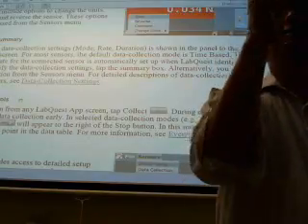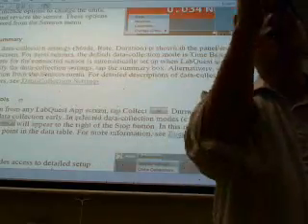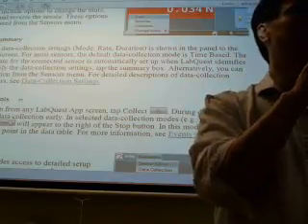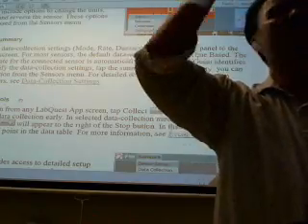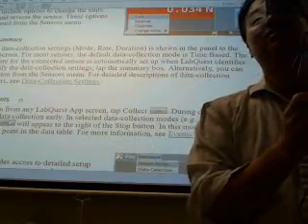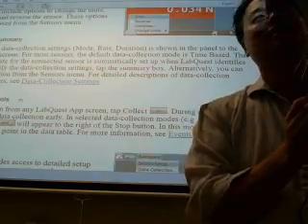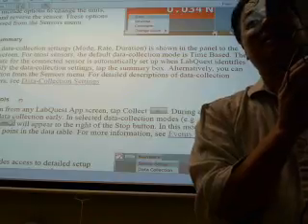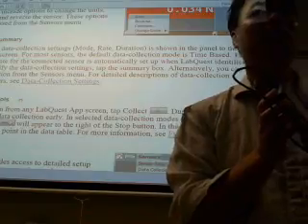The more data you collect, the bigger the data file. Sometimes you want high resolution. You want to sample as fast as possible, whatever the speed of this is. But then you're going to be collecting enormous data sets, and sometimes that's not necessary. We're actually sampling this at a very slow rate. How often are we collecting data? Every 1 minute. This thing can sample hundreds or thousands of times a second, and here we are only sampling once a minute. That's not much.